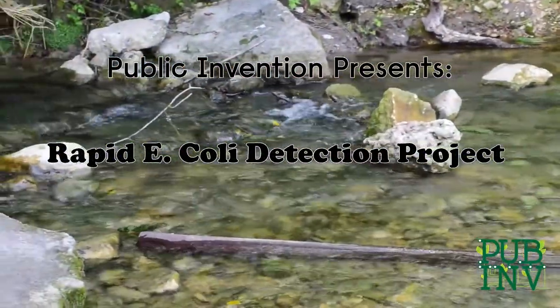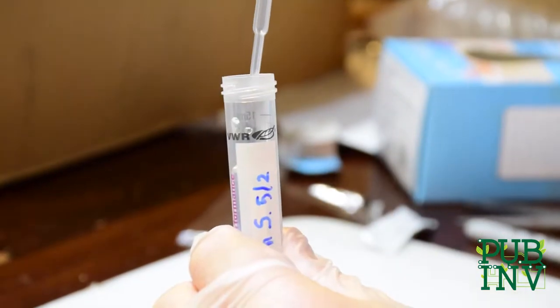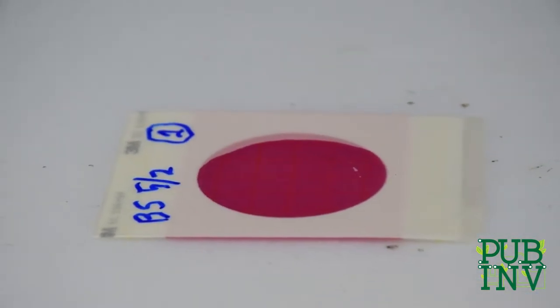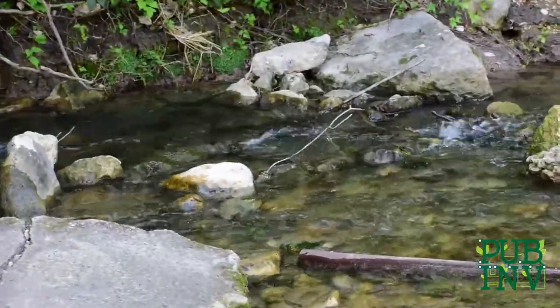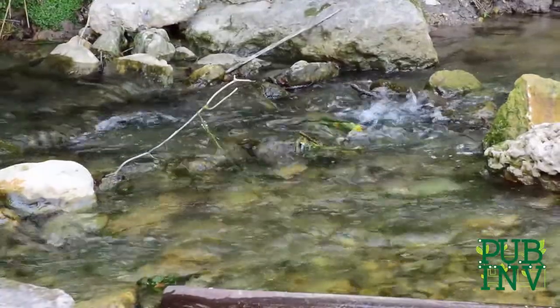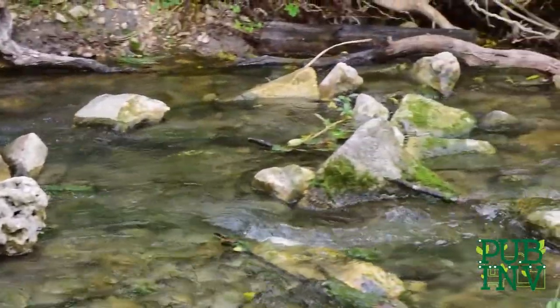In this video, you will learn how to collect water sample from a local water source, use a pipette to transfer your water samples onto a petri film, and capture your results of bacteria growth. By completing this project, you will be helping us collect data on water sources across the country, and you will learn some essential skills that may help you later on in the field of science.